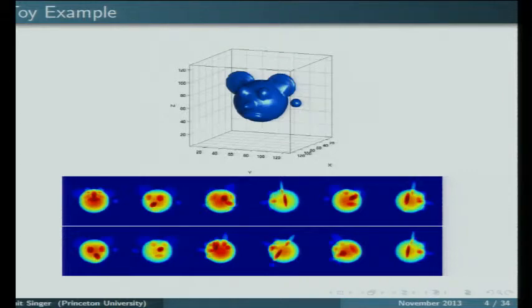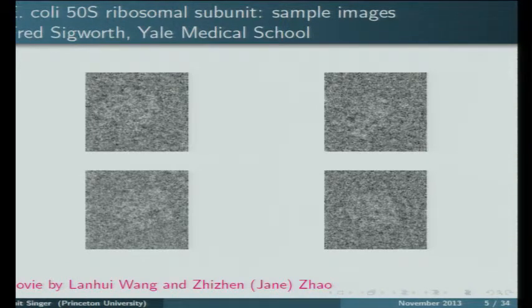Okay, good. So here maybe you can get some rough idea of what is actually pictured. From some of the images, you can make some clever guesses. But in reality, the images are very noisy. This is just 4 images out of a much larger collection of 20,000 something images, like real microscope images.